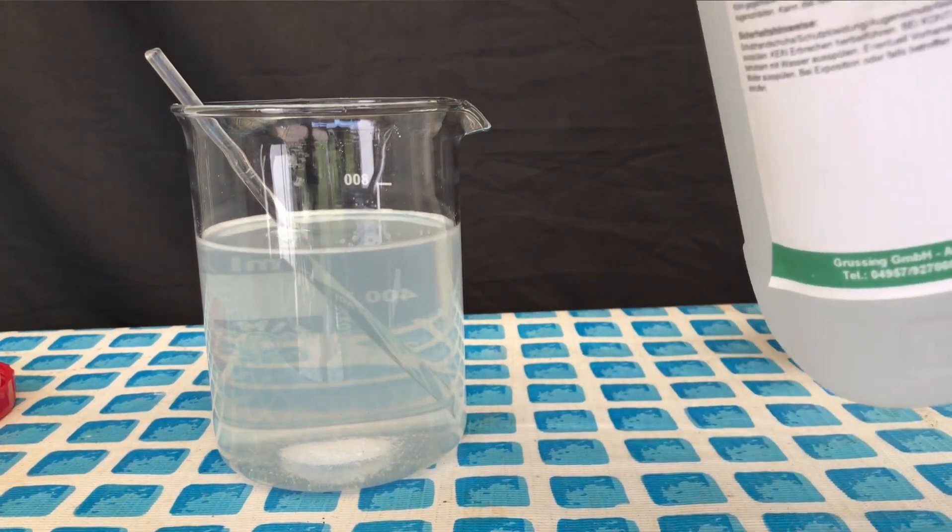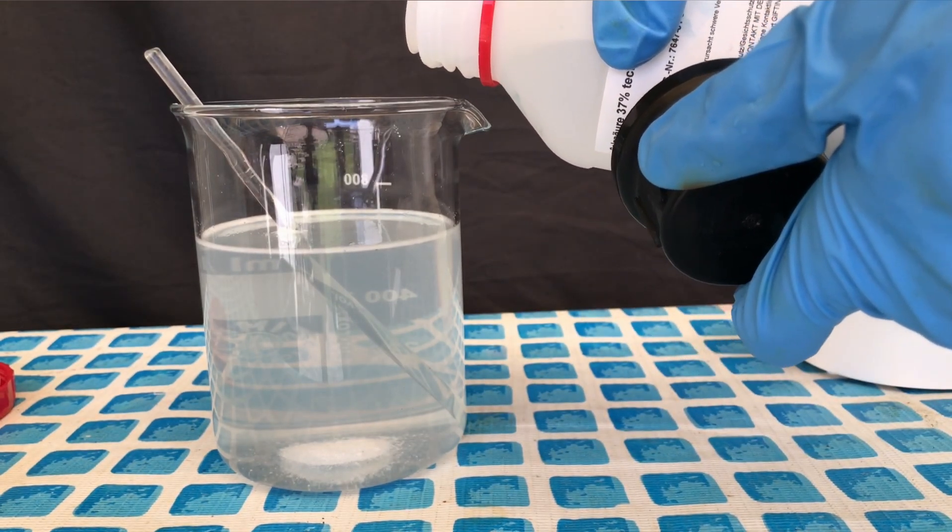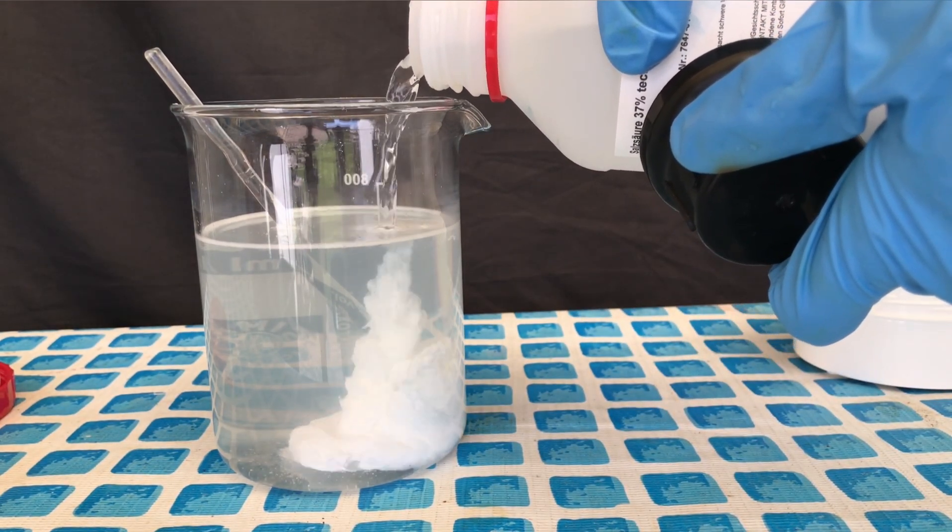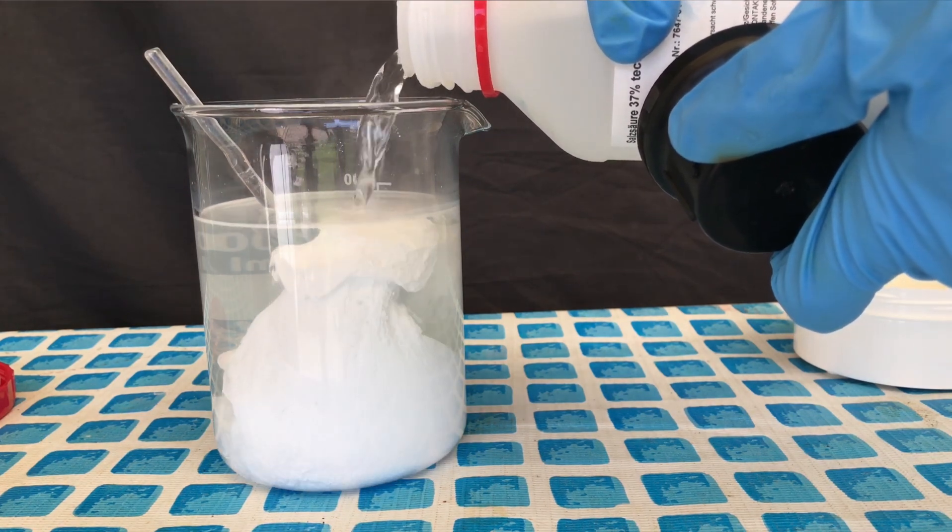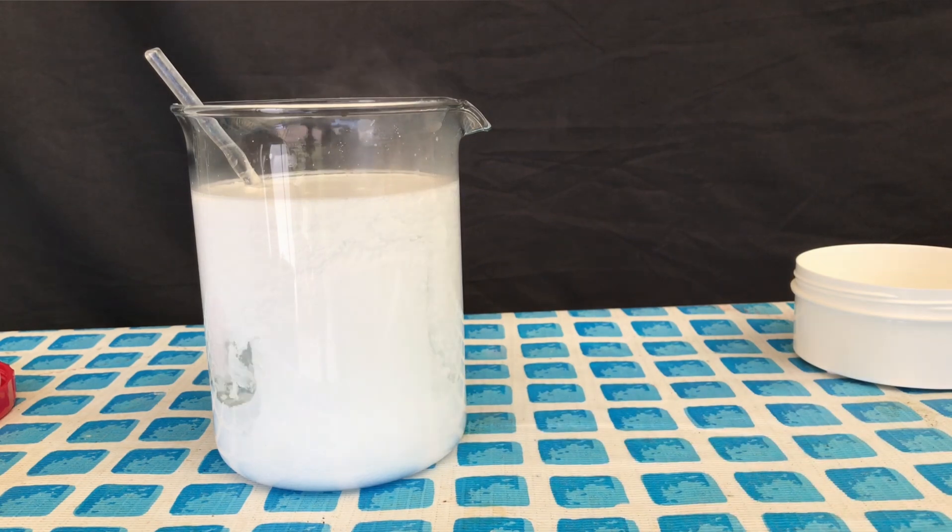Now it's time for some 37% hydrochloric acid. Low concentrations are also okay but I only have 37% hydrochloric acid. A white precipitate of insoluble lead(II) chloride immediately precipitated out.